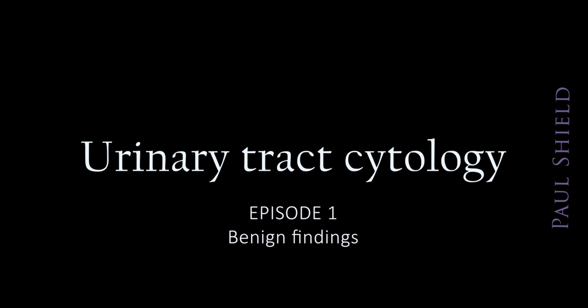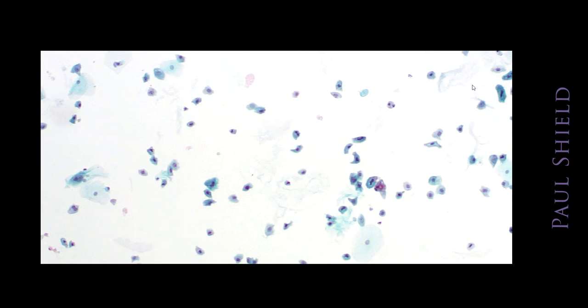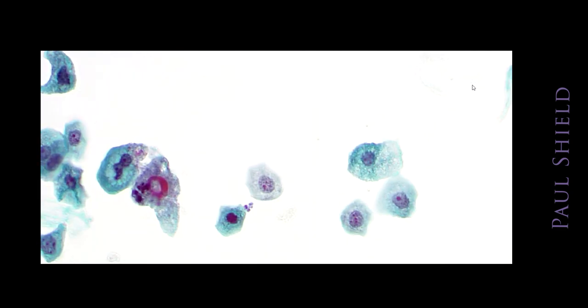Hi, it's Paul. Let's look at the benign findings in urinary tract cytology. This is a low power urine. It's a moderately cellular one. Most of the cells here are urothelial. There'll be scattered squamous cells. We're going to concentrate on urothelial cells because we've looked at squames.